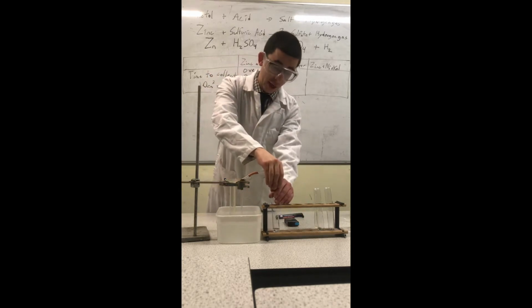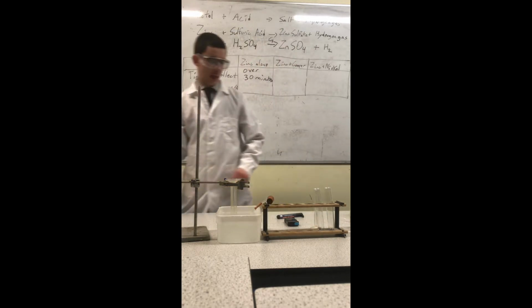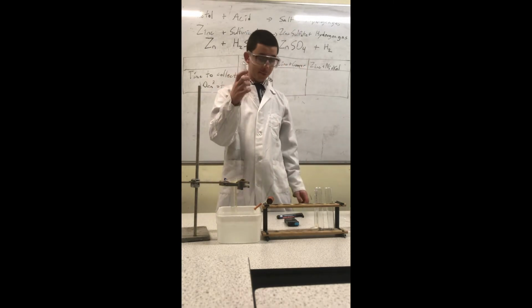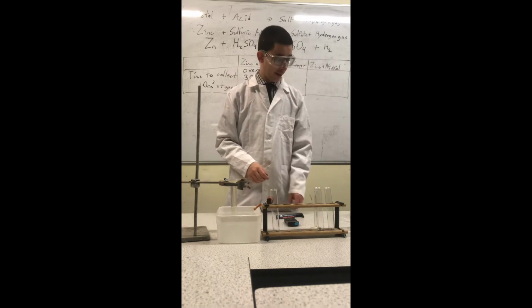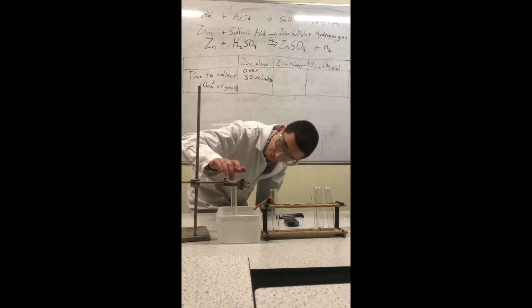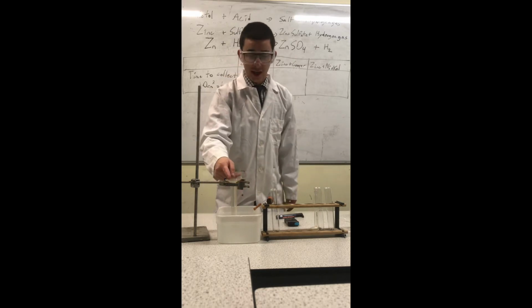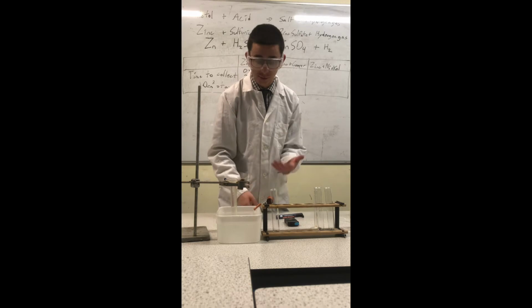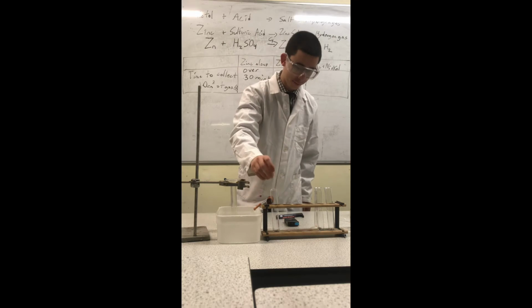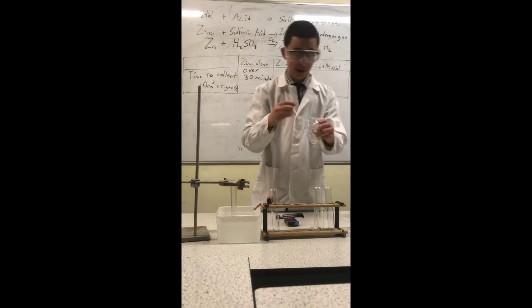Now, I'll dispose of my reactants. I'll get a clean measuring cylinder and add another piece of zinc to it. Now, in reality, there's only a very, very few small bubbles of gas in here, so I do not need to replace the water, as it will still be easy to see 10 centimeter cubed of gas collected. So once again, we'll take a piece of zinc, add it to my test tube, but this time I will use copper as a catalyst.